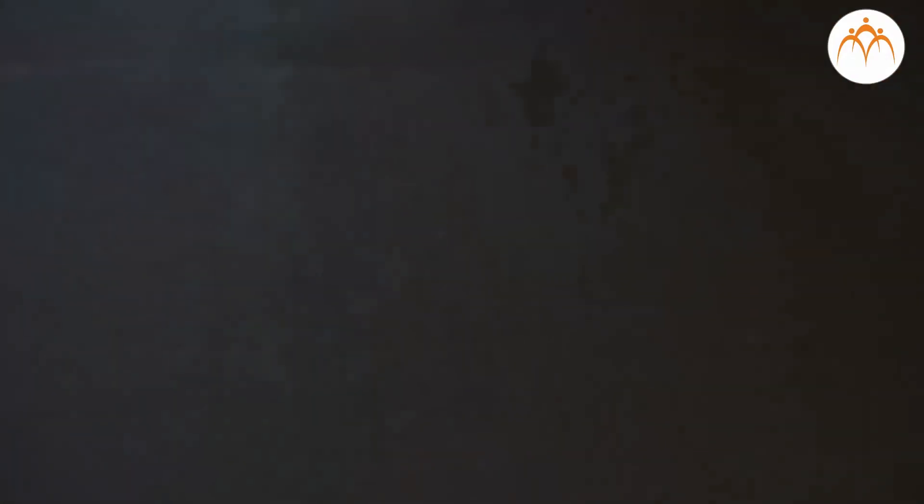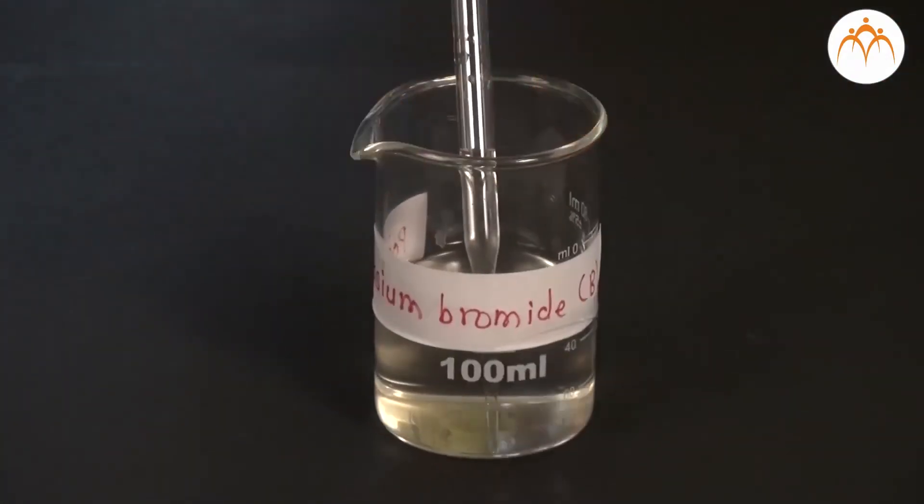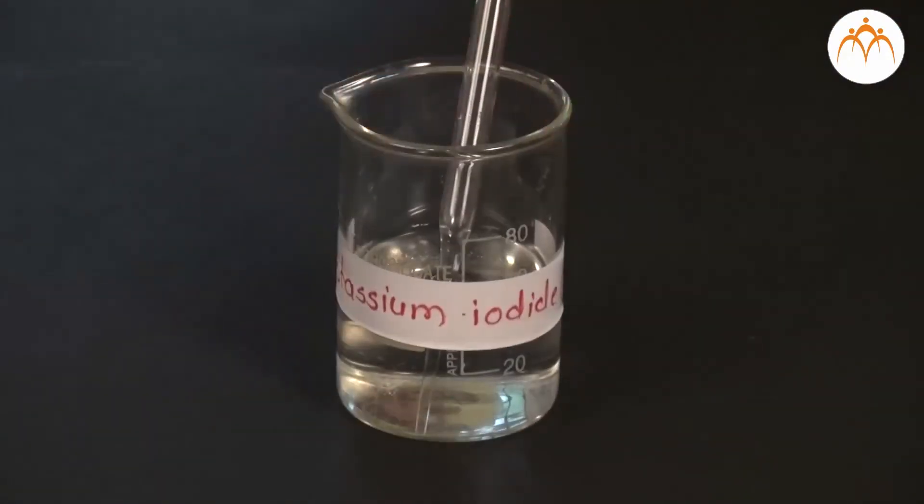Procedure. We keep solutions of potassium chloride, potassium bromide and potassium iodide in three test tubes and label them as A, B and C.